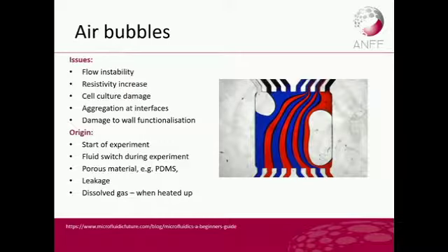It also allows aggregation at the interfaces, and depending on what you functionalize your device with, the bubbles can actually damage your functionalized wall. They may originate from many places, but here are some tips to search for where they come from and to solve it.